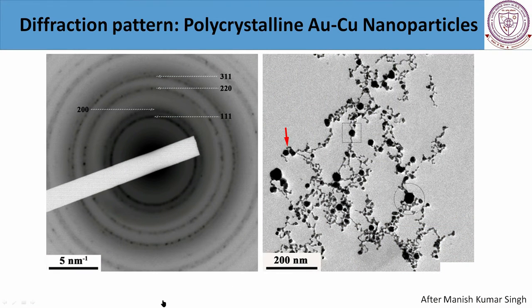What he is trying to convince you is that this is how the powder diffraction will look. Remember, in the previous slide you had a spotty ring, whereas this is known as the ring pattern. This ring pattern is from a polycrystalline material. Normally, the diffraction aperture that you have is of a couple of microns.